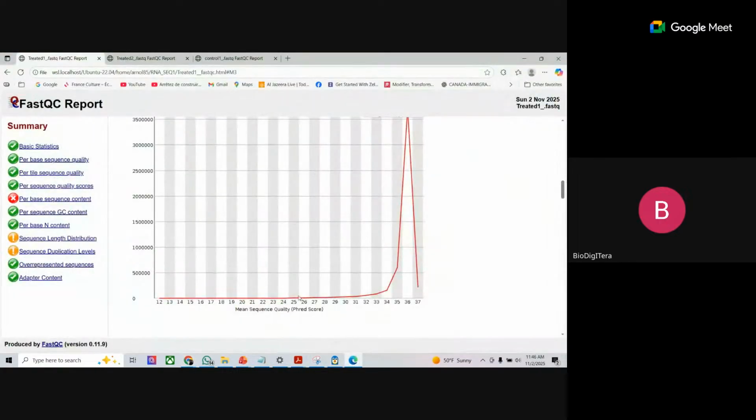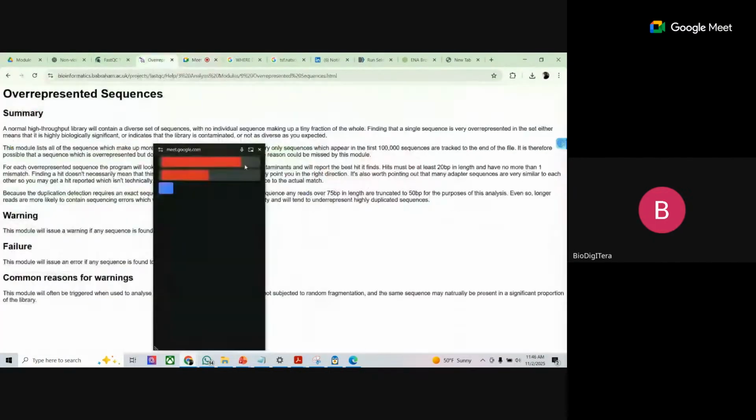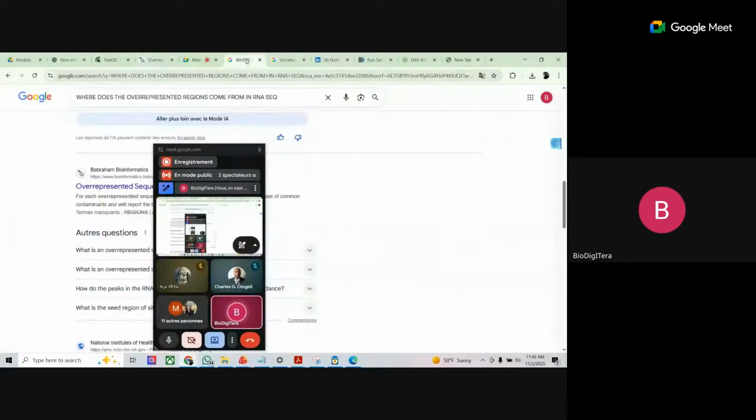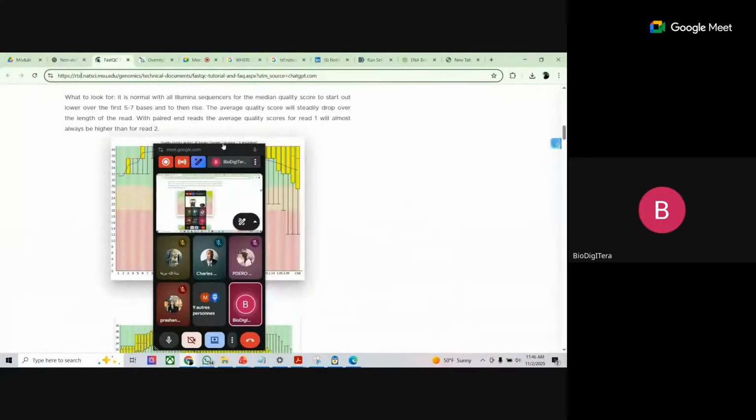Let's move to the next. Let me compare it with another one that we have here. We have one. Let me compare it.